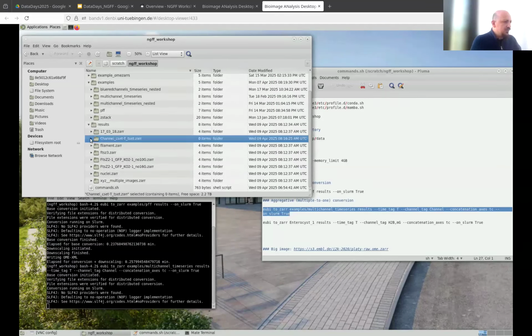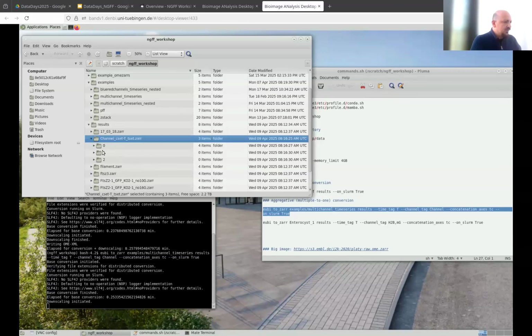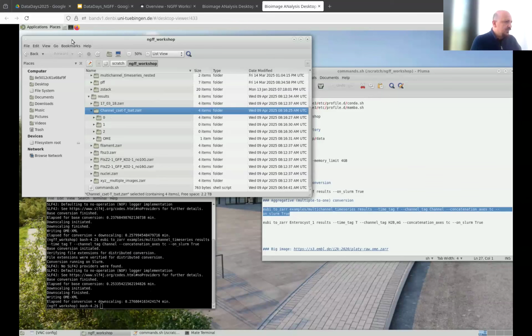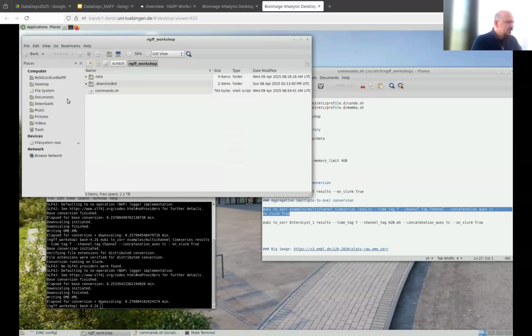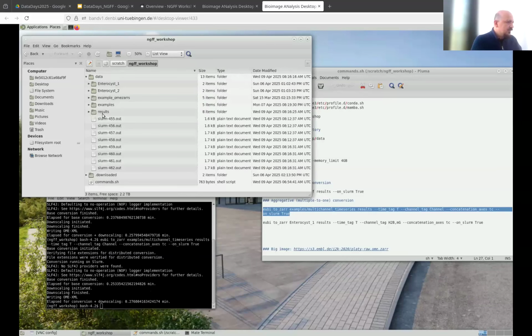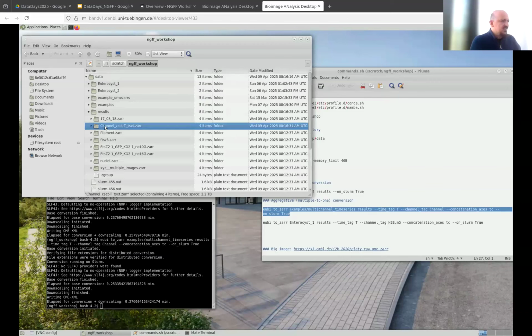Then we get this output. Now it also created the, maybe I also see the metadata files. So this is the output folder, and you see that it has simply reduced the multiple file numbers to this string as a set. So it's a channel set and then a time set. And we have 3 resolution layers, again, created by default, but you can also update these.